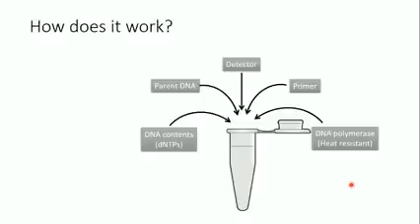The detector is what the spectrofluorometer detects. So this is the very important thing in the real-time PCR, the detector. So I'm going to speak about the detectors used in the real-time PCR.